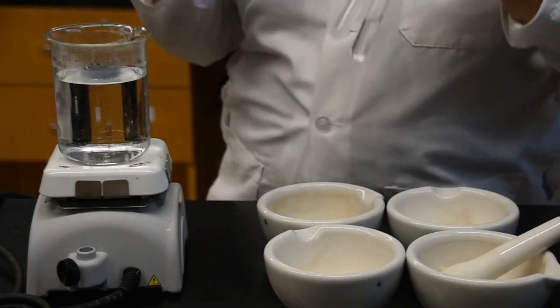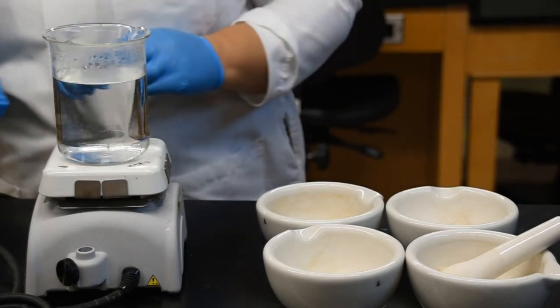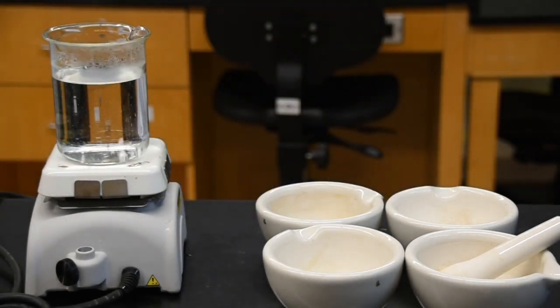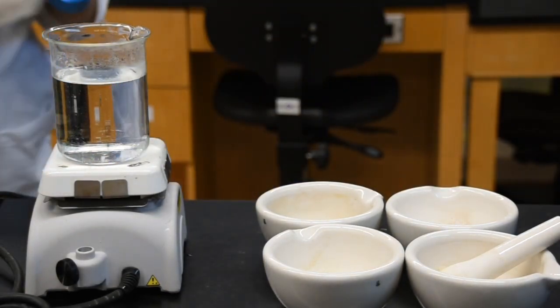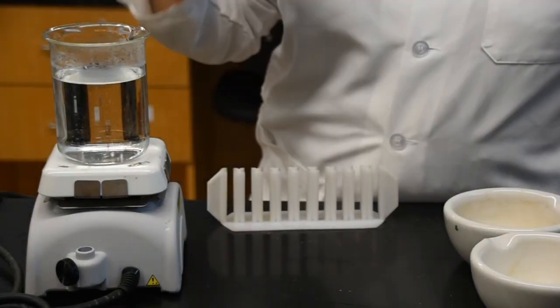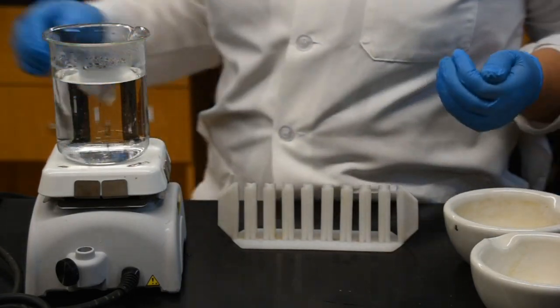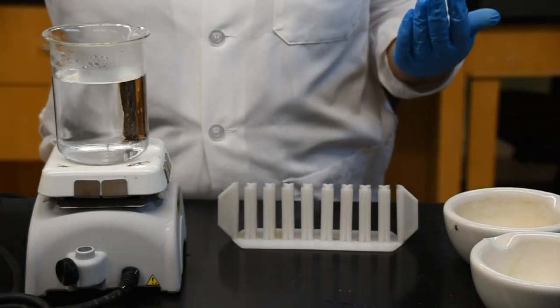And you always want to use this as an indicator for your experiment to see if something tested positive or negative. So I'm going to show you how my typical setup is for one, and then I'm going to come back and show you what the result of each of these experiments was. So let me show you one setup first.